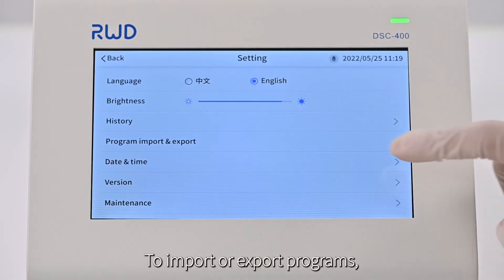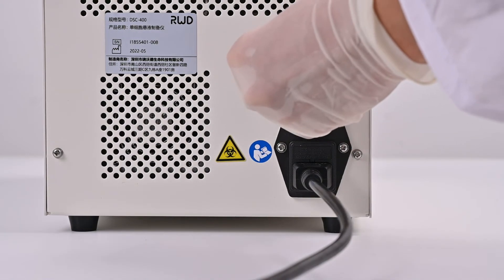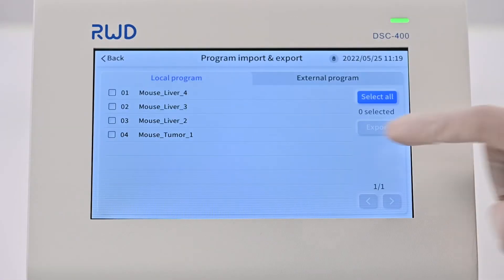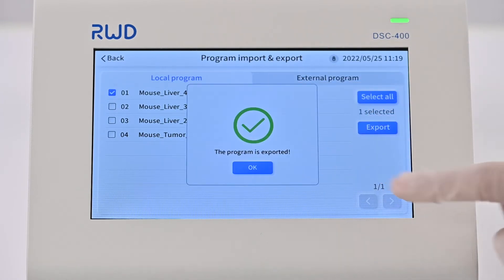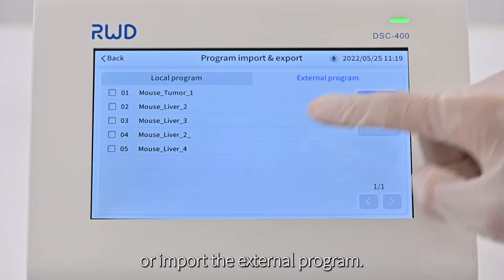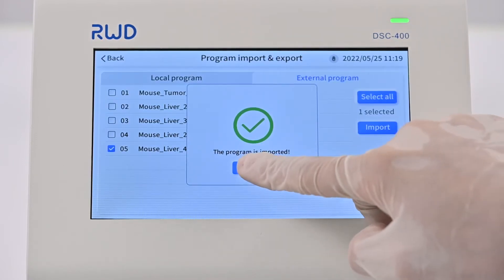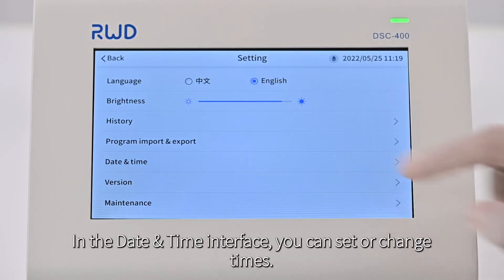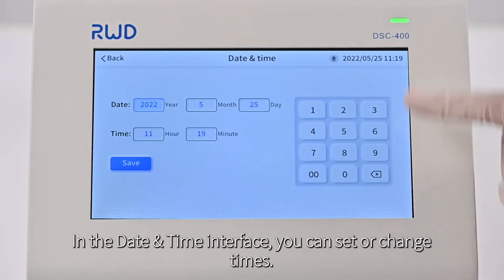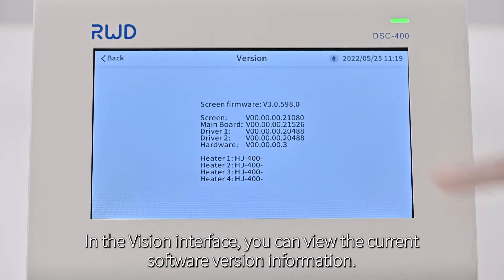To import or export programs, you need to connect a U-Disk to the USB-A port. After that, you can either export the local program or import an external program. In the date-time interface, you can set or change times. In the version interface, you can view the current software version information.